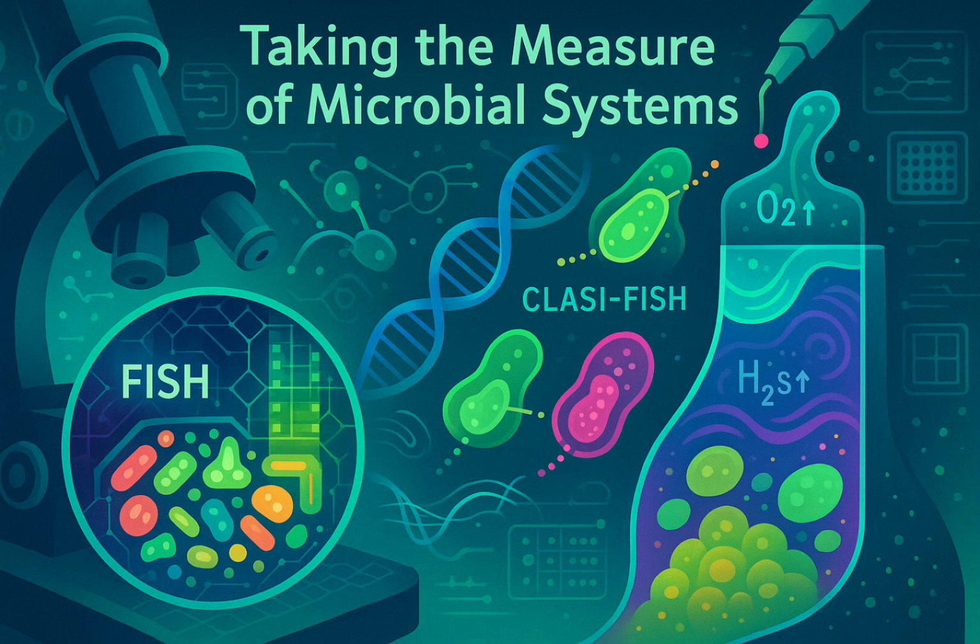Okay, that's the classic workflow. But what about those microbes that just refuse to play ball, the really low abundance ones, or the super slow growers that get lost in the mix? Right, that's where we need to get more targeted. Single-cell isolation methods are key here. Things like laser tweezers. It's amazing.